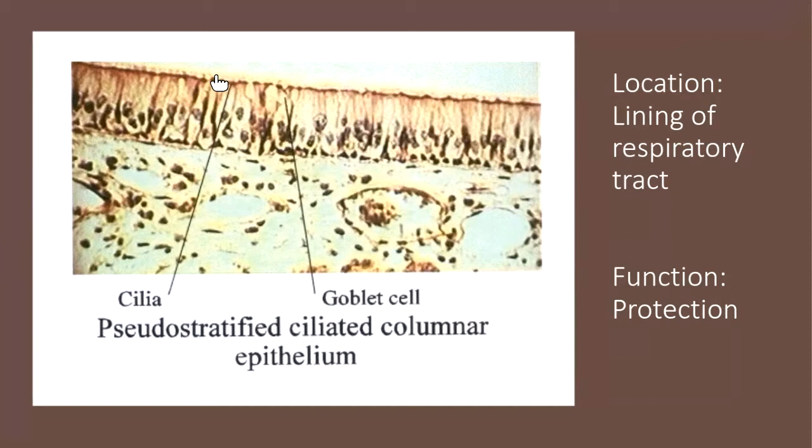And this is actually found in the lining of your respiratory tract. So this is going to beat that mucus back towards your mouth so that you can either spit it out or swallow it and get rid of it, and then hopefully help clear out the passageway. So that's pretty much a protective function overall. Whenever we talk about that mucus escalator, that's what that's called, the mucus escalator. Don't get stuck on that one at the mall if you ever go back to the mall.